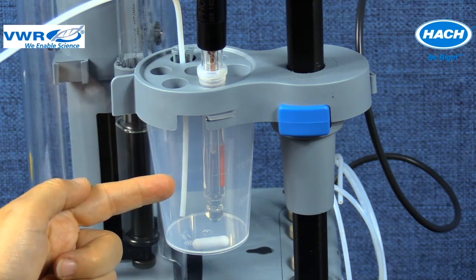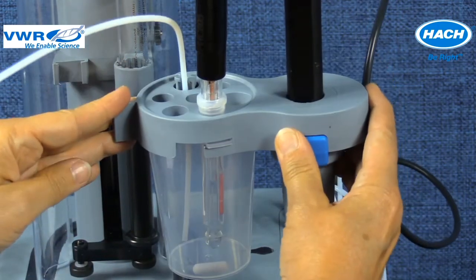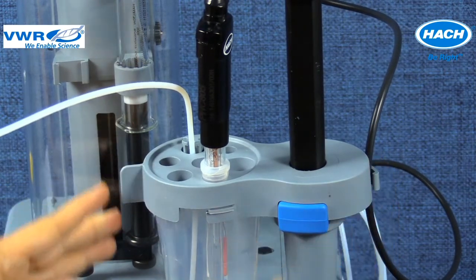The PHC805PH electrode is a refillable probe. It is important to confirm that there is adequate filling solution and the filling hole is open during the titration.